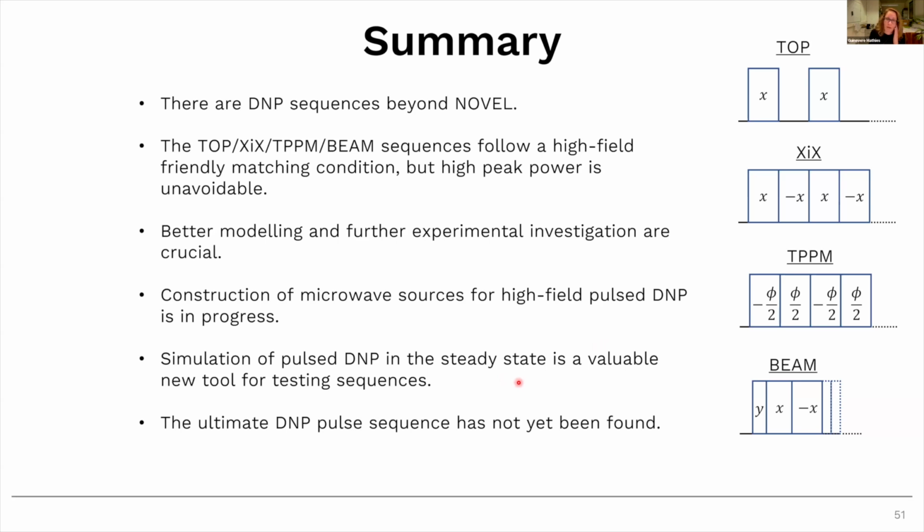And so it's a valuable new tool for testing pulse sequences. And as a final bullet point, the ultimate DNP sequence has not yet been found. There are other sequences out there, maybe also dedicated to answering different questions or different types of DNP experiments. And so we just have to design them, test them, and use them.